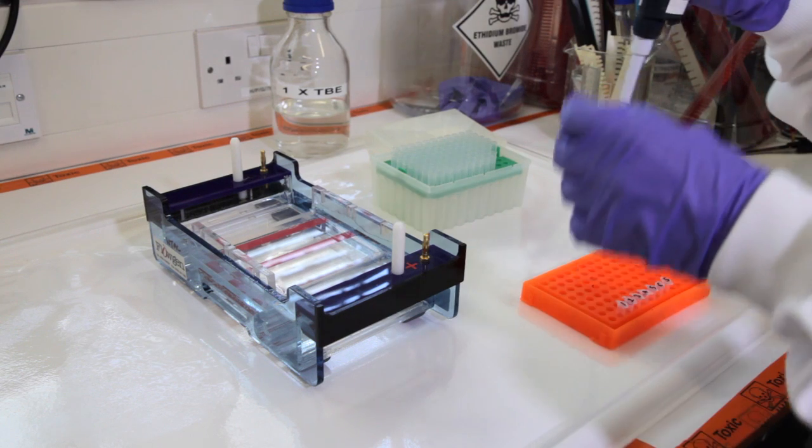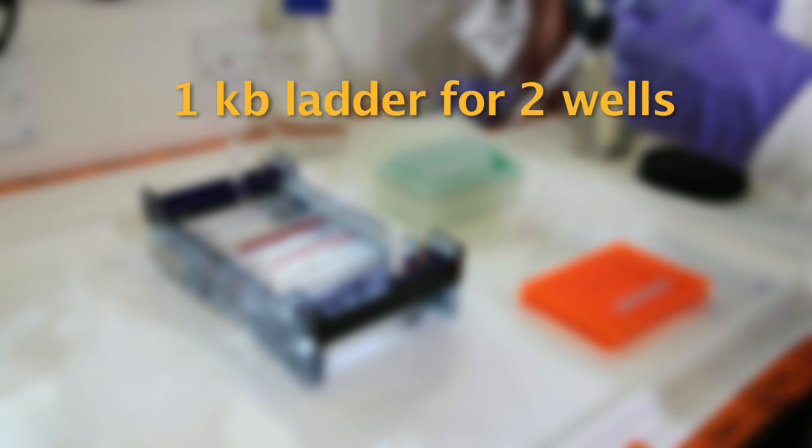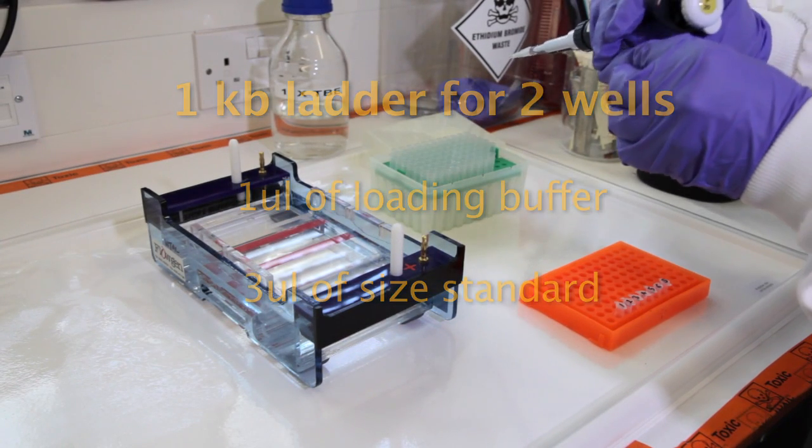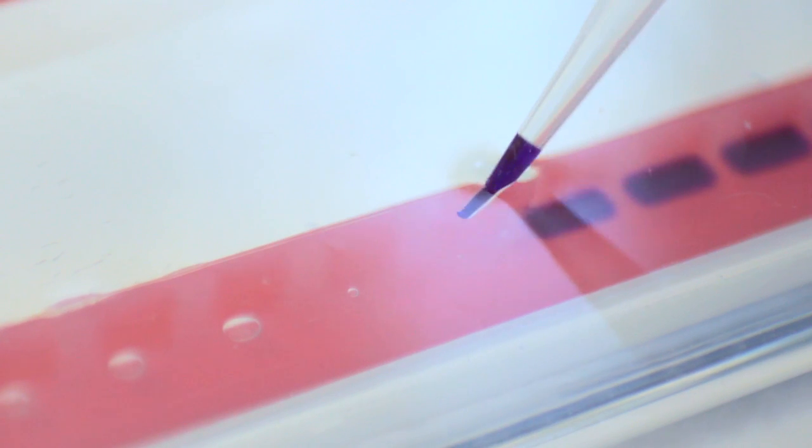Now make up two lots of size standard. Today we will use a 1 KB ladder. To make enough for two wells combine 1 microliter of loading buffer and 3 microliters of size standard. Carefully load 2 microliters of the size standard into the first well, taking care not to pierce the bottom of the well with the pipette tip. Keep the tip of the pipette just above the bottom of the well.